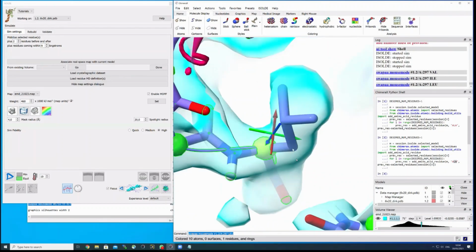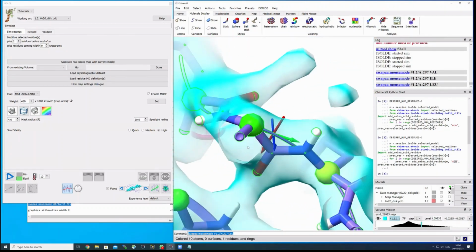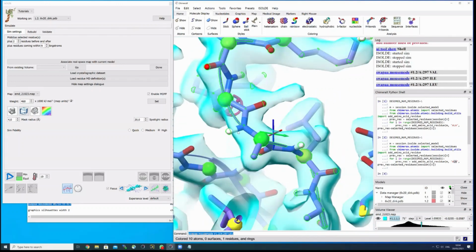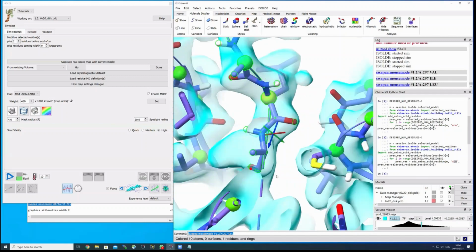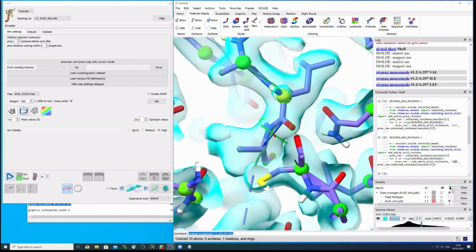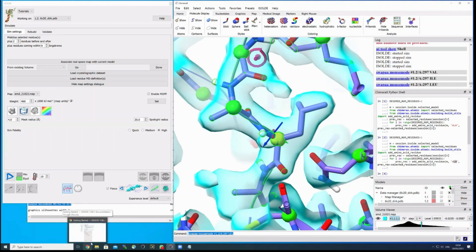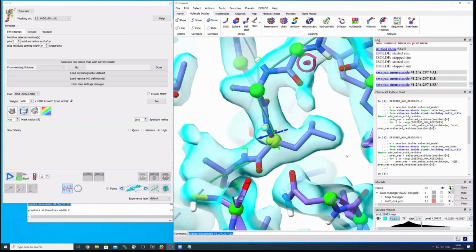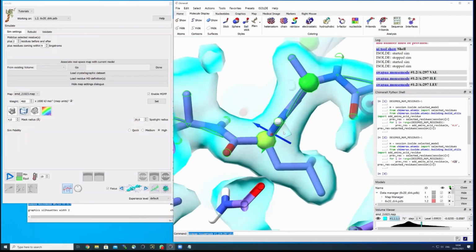But with the sequence, it's leucine, fits very well. You can change it to leucine. This one here probably is an alanine. Yes. And the next one down the row, I don't know what it is. So I would have to check the sequence myself. So for doing this, you can go to the UniProt webpage, use the identifier that I gave you. And with this, I think we can close for today, and you can start trying to build the rest.